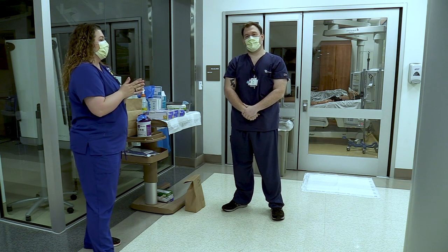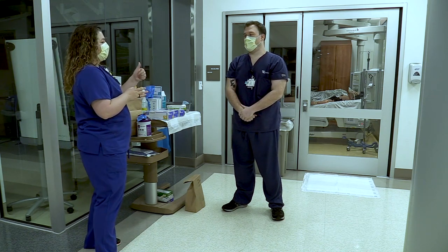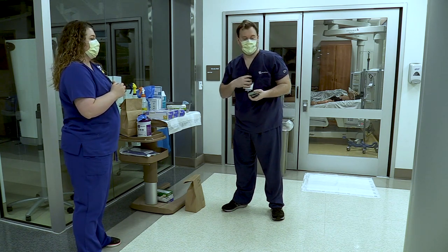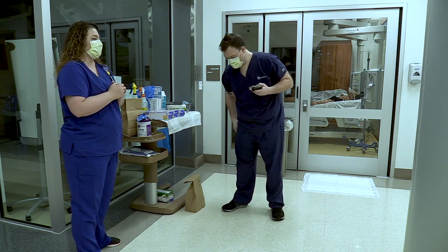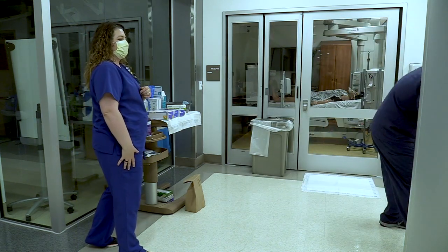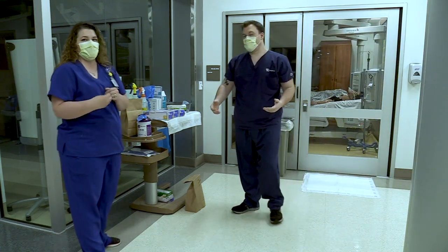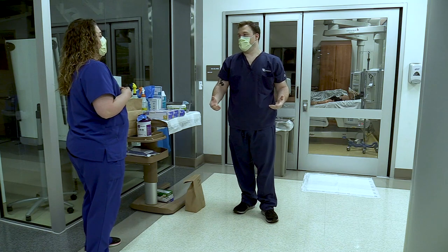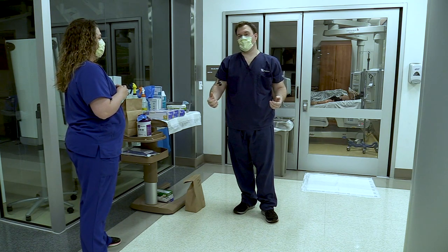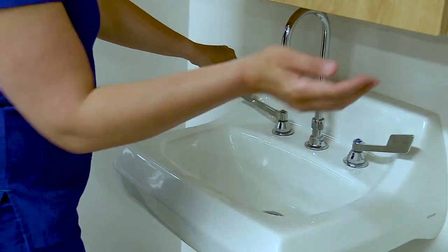To start the donning process, we're going to make sure Josh has everything out of his pockets — badges, lanyards, cell phones, anything that would cause him to reach into his pockets while in an isolation room, or that may pose a threat to breaking his PPE. Now that Josh has taken all of his items off, he's going to thoroughly wash with soap and water his hands from the elbow down.